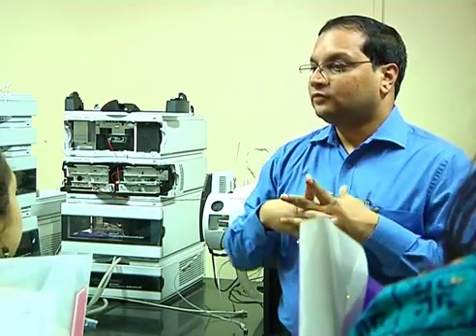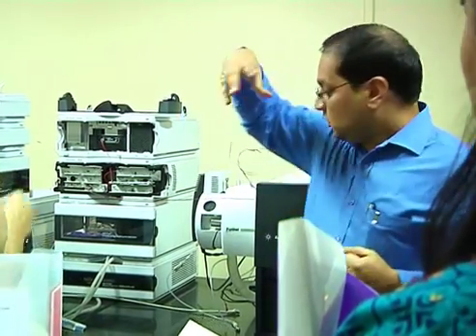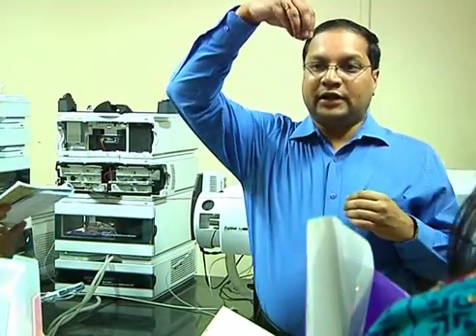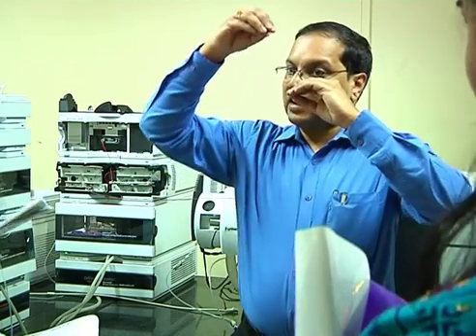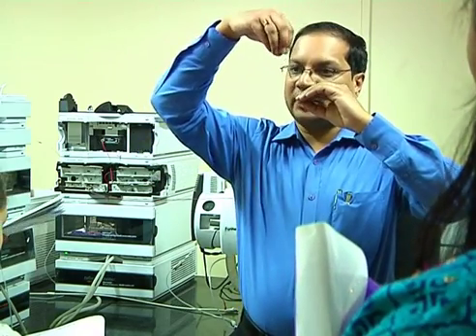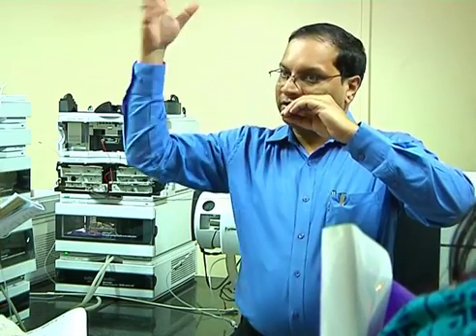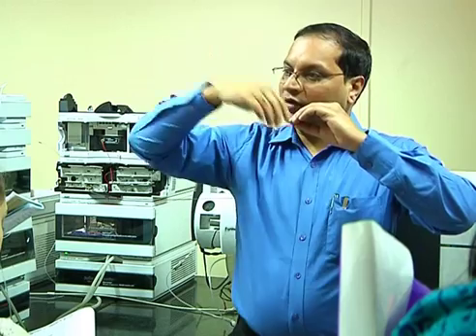Electrospray ionization, or properly called pneumatically assisted electrospray. Why so? There is something called a spray. The stream of liquid goes into the needle and then it is sprayed. Because our analytes are already charged in the liquid, I want only those charged analytes to get in, not the acetonitrile, formic acid and all those things. I want to get rid of that, and the ions should go in. That is the objective.